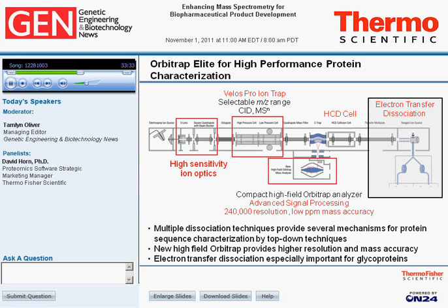Also, we have a third type of MS/MS, electron transfer dissociation, and that's actually a critical component of doing biopharma analysis, largely because the IgG heavy chain has those conserved glycosylation sites. If you do collisional activation techniques, those glycosylations will fall apart first, and you basically don't get any backbone fragmentation. With electron transfer dissociation, you cleave only the amino acid backbone. You don't cleave the glycans, and so what you end up getting is a large amount of sequence coverage by ETD you wouldn't be able to do any other way. So that's very important. So you have 3 types of MS/MS modes for sequencing, and this instrument is about as good as you can find for protein sequencing, whether it's bottom-up or top-down.